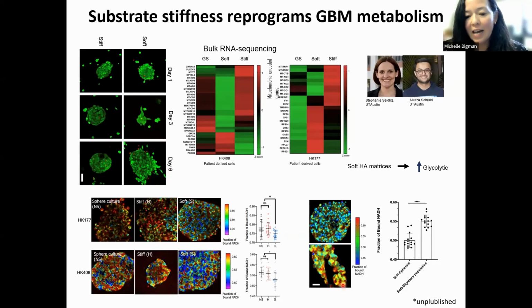So when he zoomed into these leading cells that are getting out of the tumor microenvironment, in the FLIM image, what he noticed is that the fractional contribution of bound NADH goes up. So actually in the soft material, there is a positive increase in OXPHOS, as we saw with our previous data. And it is only these invading cells where OXPHOS is going up.